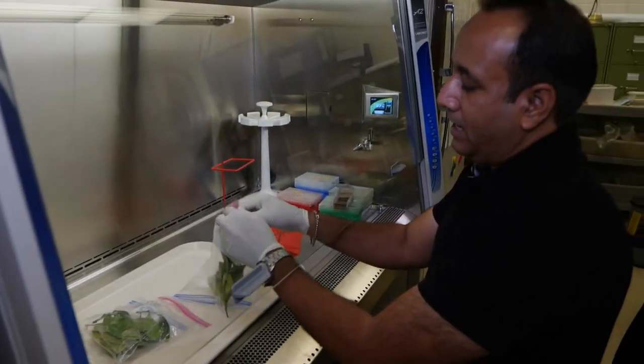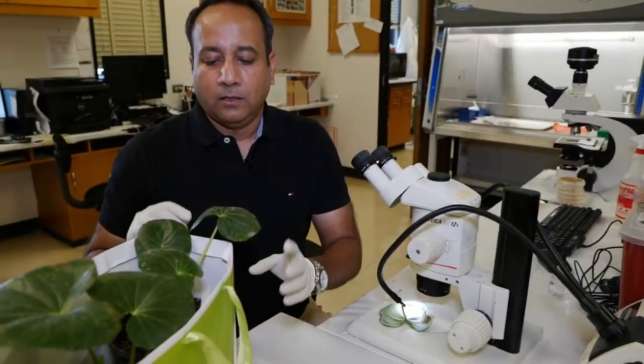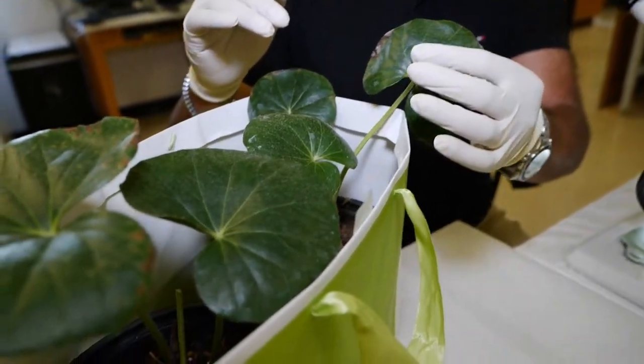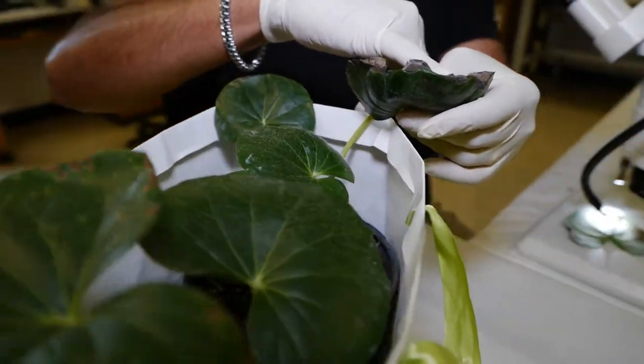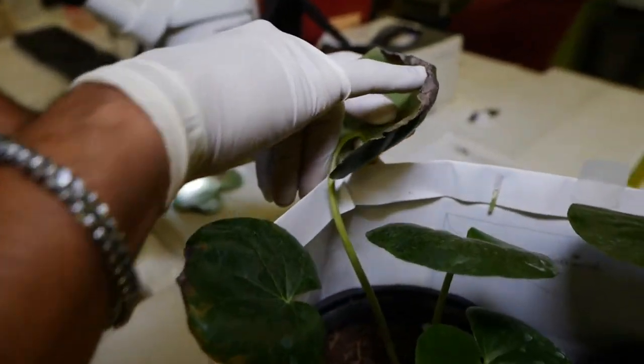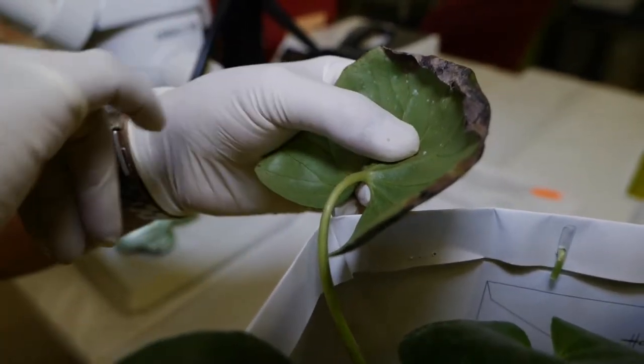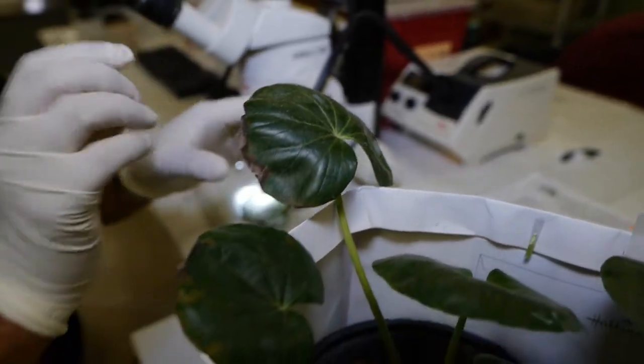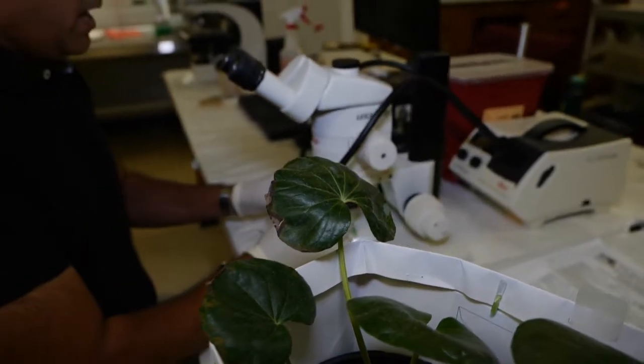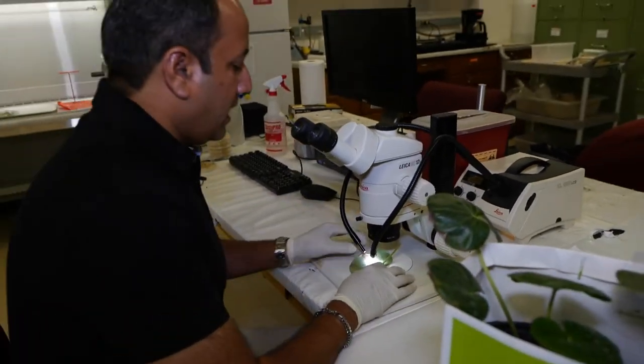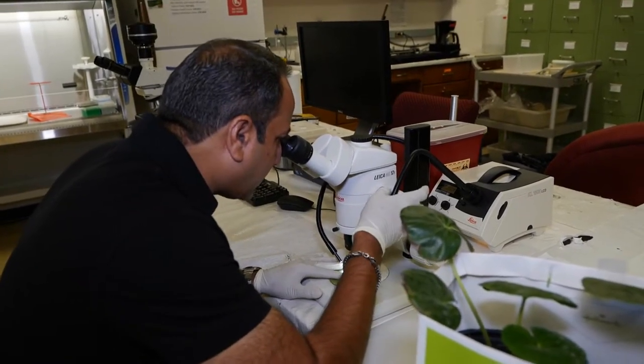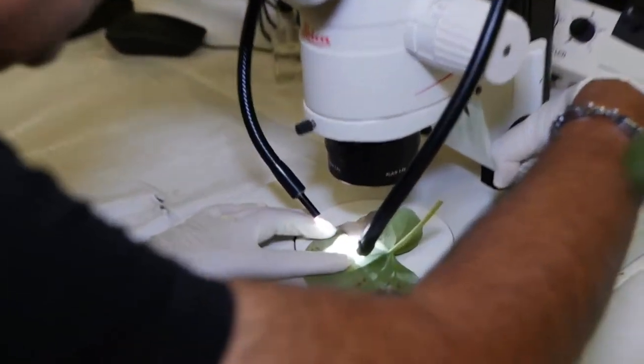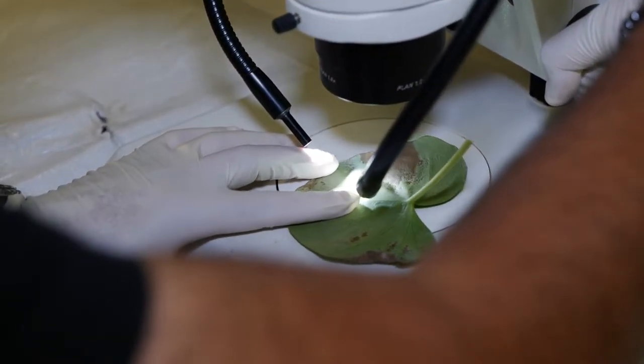In this case, this sample came from a nursery owner in Rapides parish, and they are worried about these necrotic lesions on the margins of this plant. In these kinds of samples, the first thing we do is take the leaves under a dissecting microscope and see if we can find any fungal structures or any signs of fungal disease.